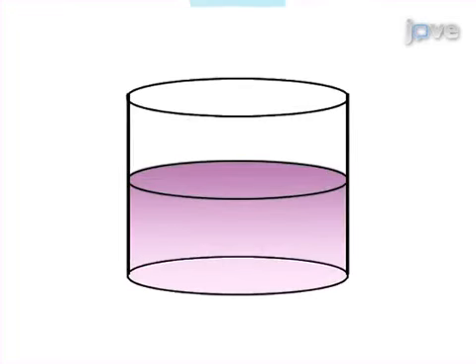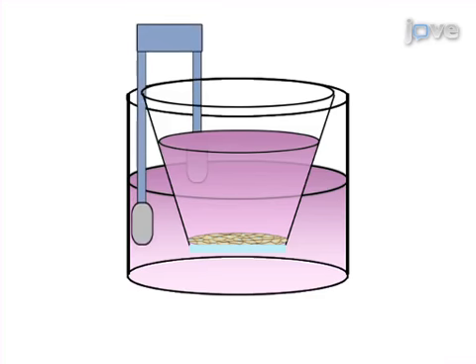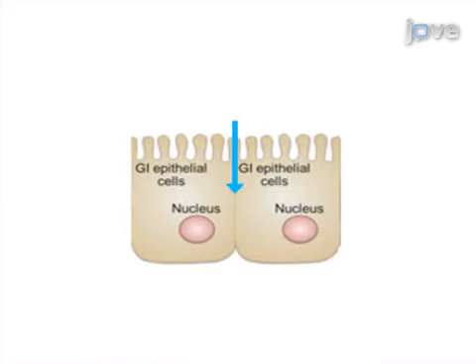This is accomplished by first culturing Caco-2 cells on transwell inserts to allow cell differentiation and formation of a cell monolayer. The second step is to validate that this model represents a permeability barrier by measuring the transepithelial electrical resistance, immunostaining cell junctions, and assessing passive permeability of a detectable tracer molecule.